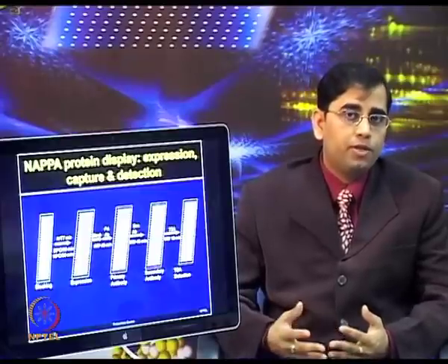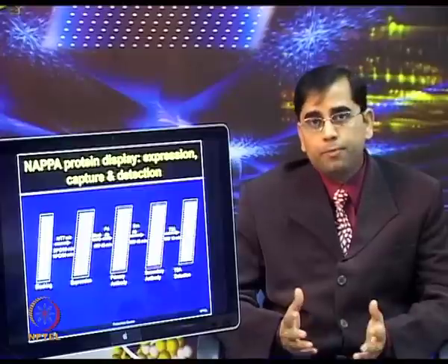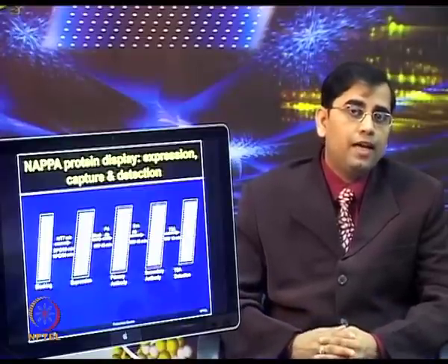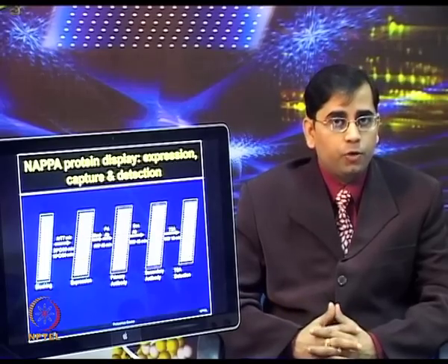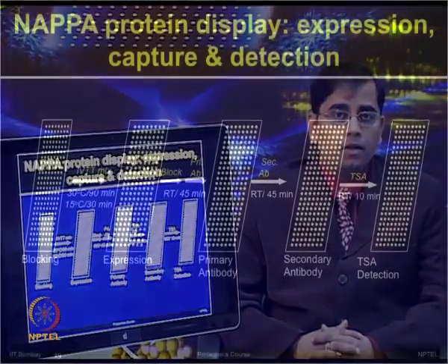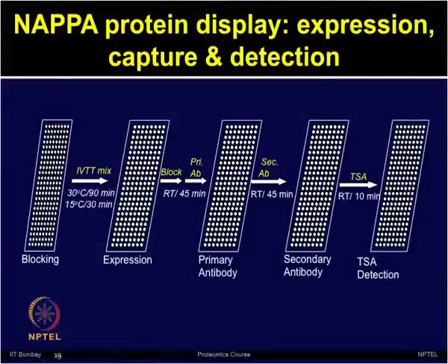One is the protein expression, and then when the proteins are expressed in that cell-free environment, after that the protein has to be captured with the capture antibody. So, this lowering of temperature helps in that step. Once the proteins are expressed, you need to wash away all the lysate, such as the rabbit reticulocyte lysate, which was added in the mixture.